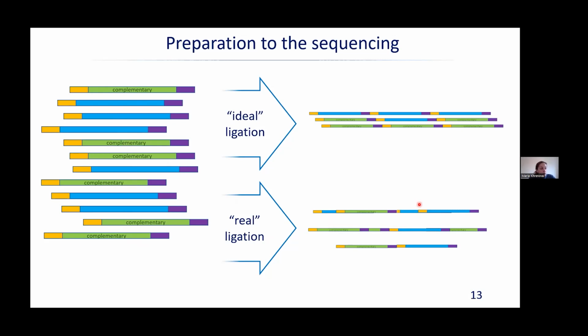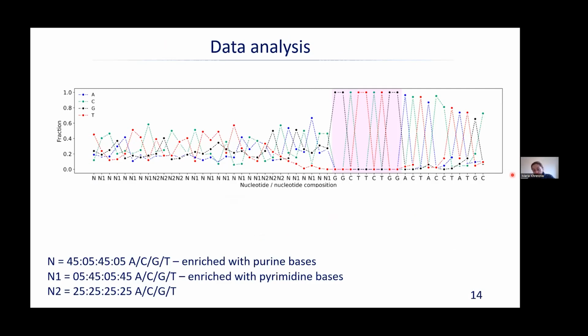But anyway, we had to deal with them. Therefore, we proposed a way to analyze these quite random sequences. So what we did, we utilized an alignment frame composed of 9 nucleotides in the beginning of the right flanking region. And then we checked the enrichment of oligonucleotides at positions that are close to this alignment frame.